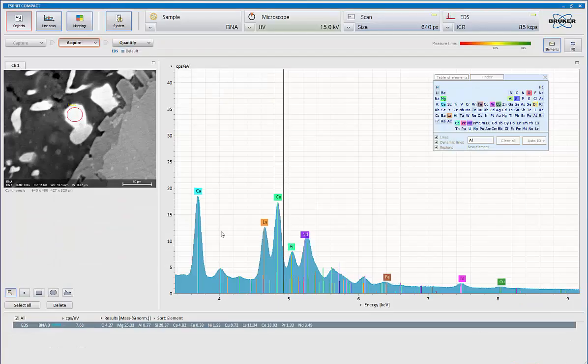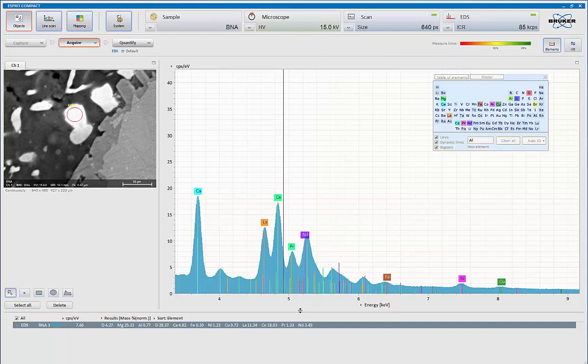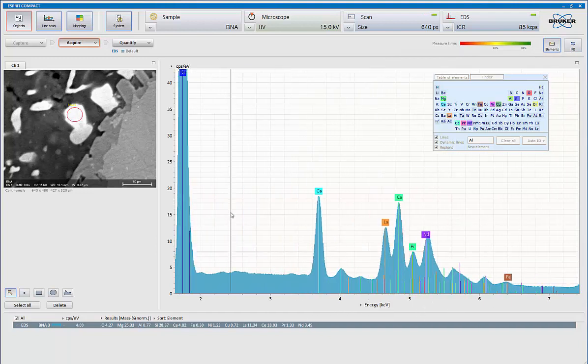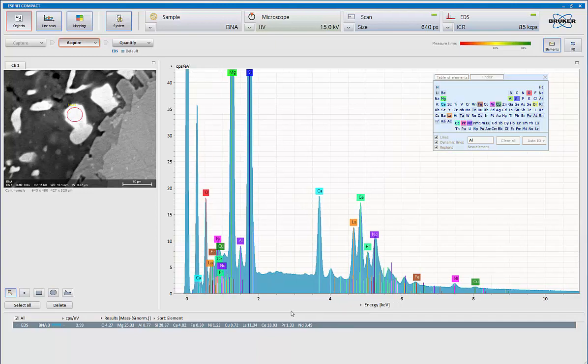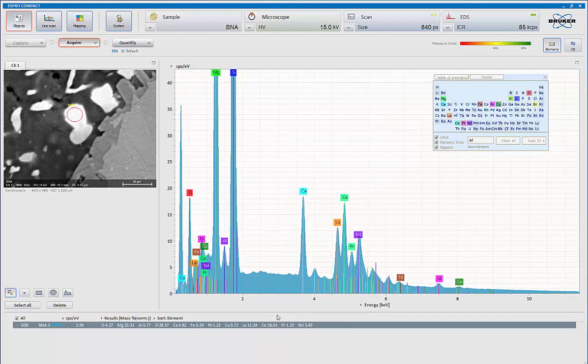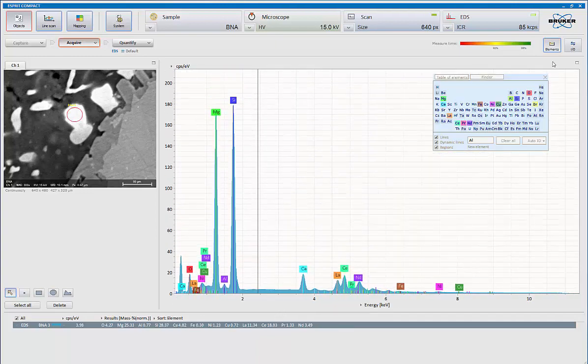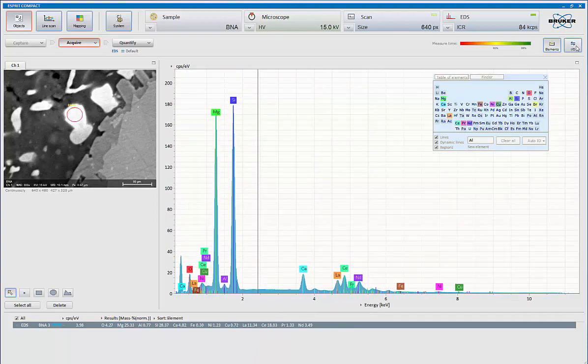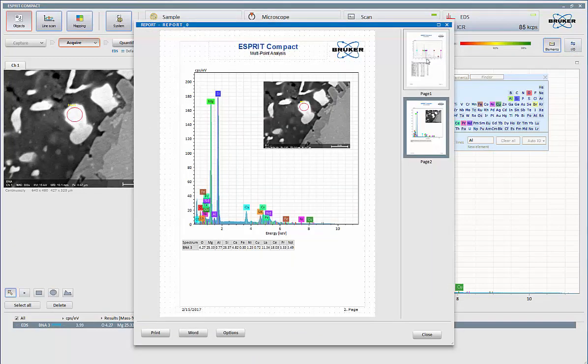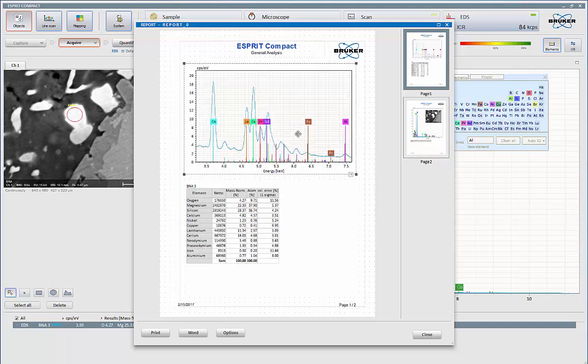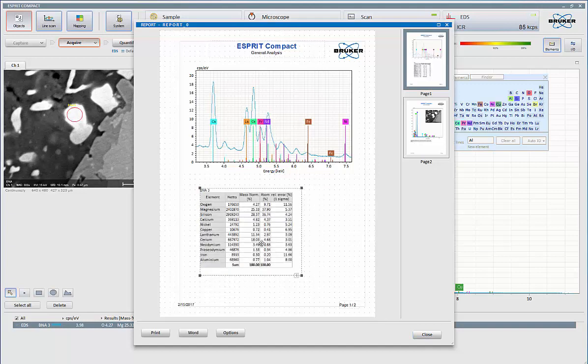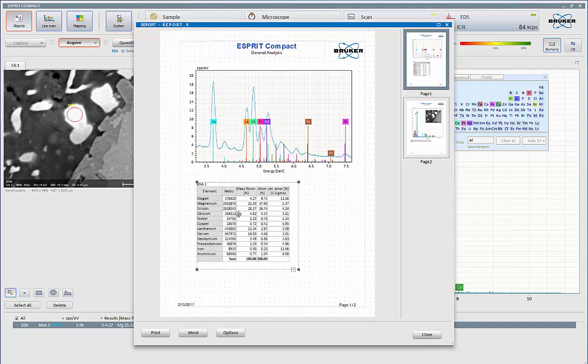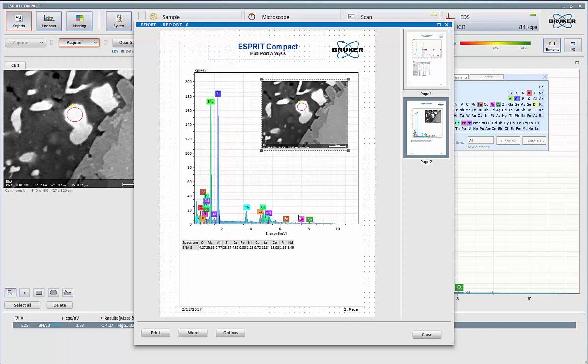OK, accepts the results, closes it down, and updates the display. So if I wish, now let's put all of this into my report. So we can show the overall spectrum, that looks pretty good. And now I'm going to come in here and say, add to report. And now, here's my data showing the deconvolution, showing the results from the quant up there, and the output of the results. This shows me the image and the overall spectrum in that.